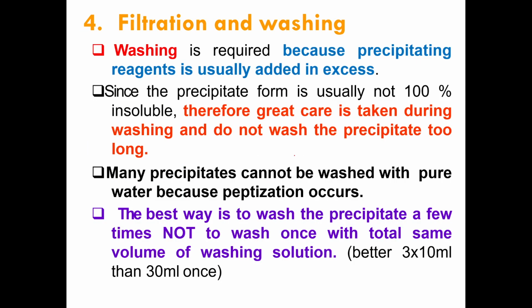For filtration and washing, washing is required because the precipitating reagent is usually added in excess. So we need to wash the precipitate. Sometimes the reagent or the analyte is still attached to the surface of the precipitate. Since the precipitate is usually not 100% insoluble, great care is taken during washing, and do not wash the precipitate too long. If you wash the precipitate too long, what happens to it? Sometimes the precipitate can dissolve to become a solution.